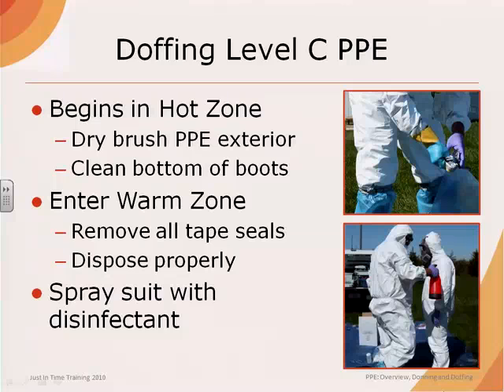Doffing begins in the hot zone or exclusion zone by dry brushing off the exterior of PPE. Scrub organic debris off the bottom of boots. Enter the warm zone to continue the doffing procedure. Remove all chemical-resistant tape from your suit and dispose of it in the proper provided container. Spray the exterior of PPE with an appropriate disinfectant product.